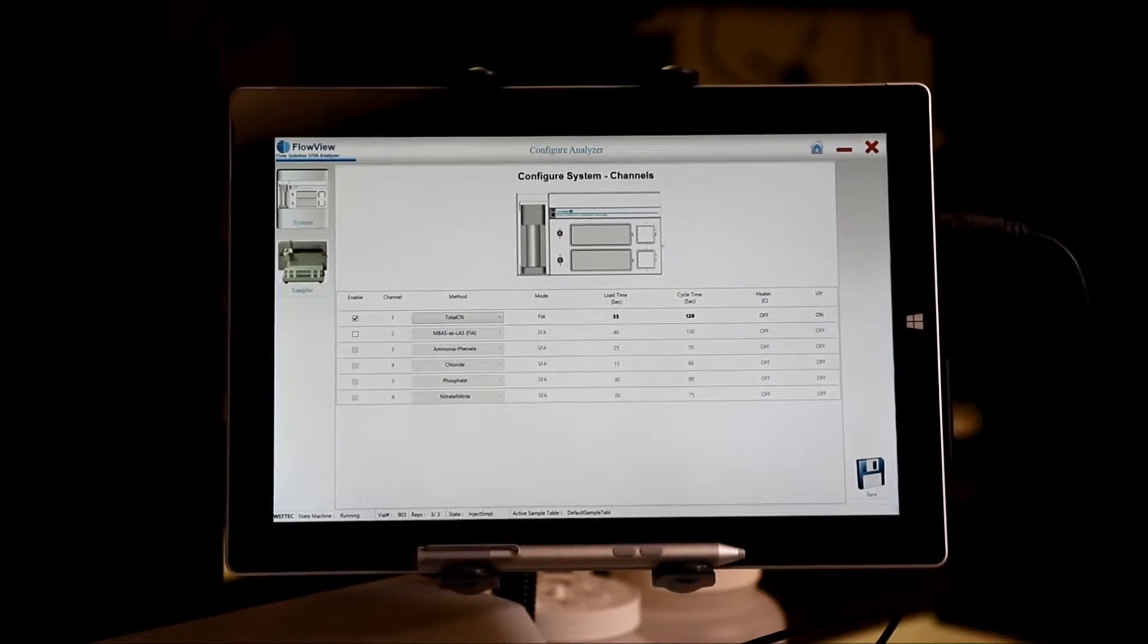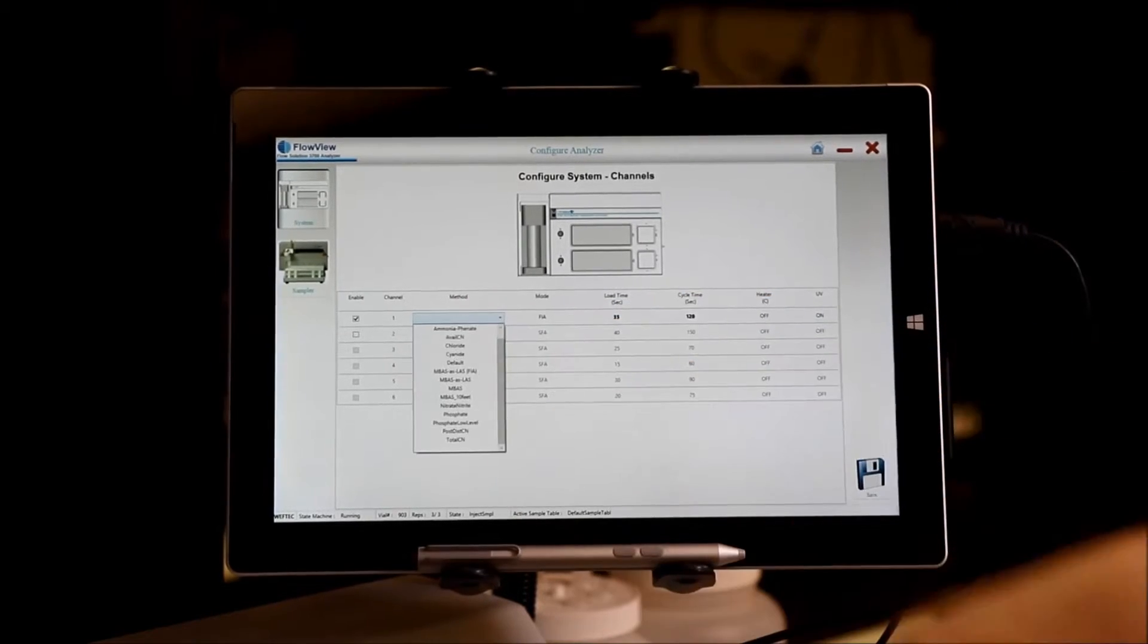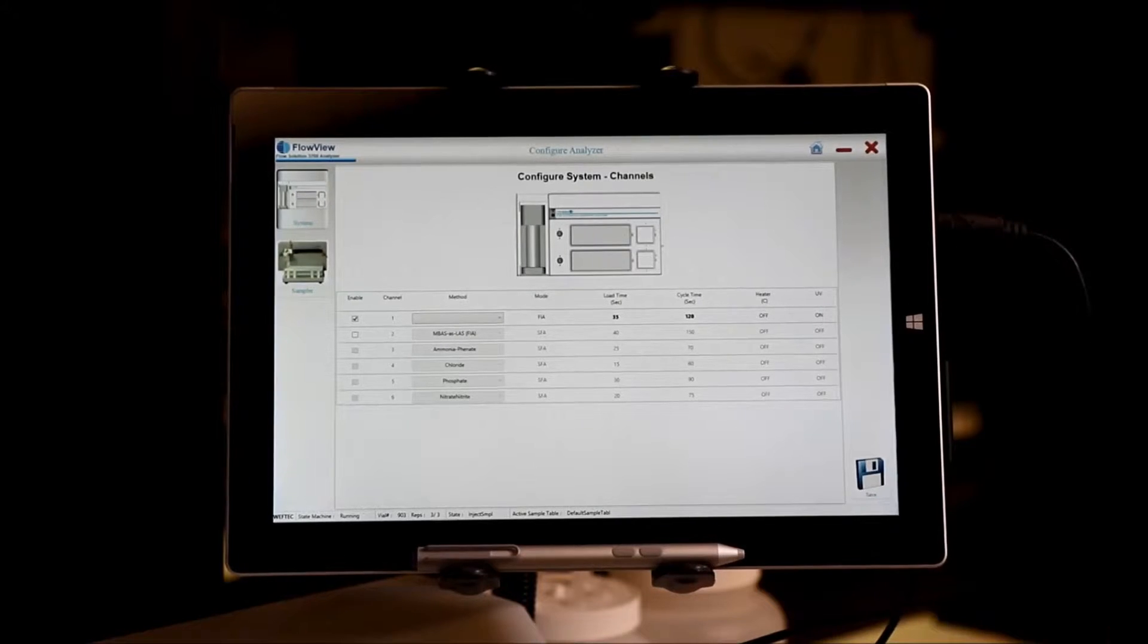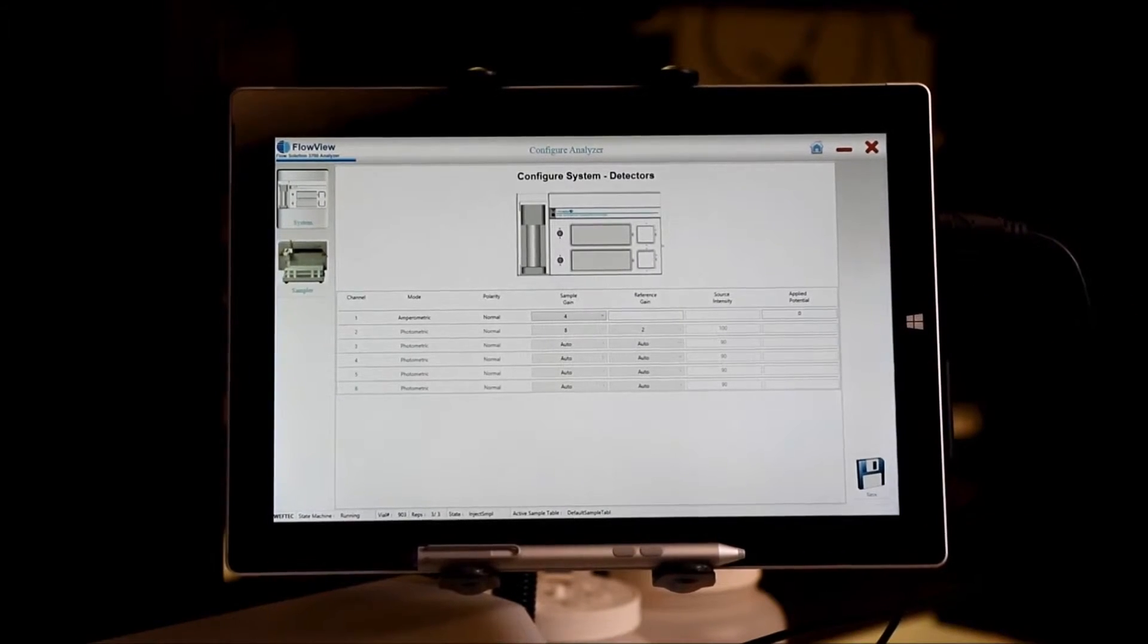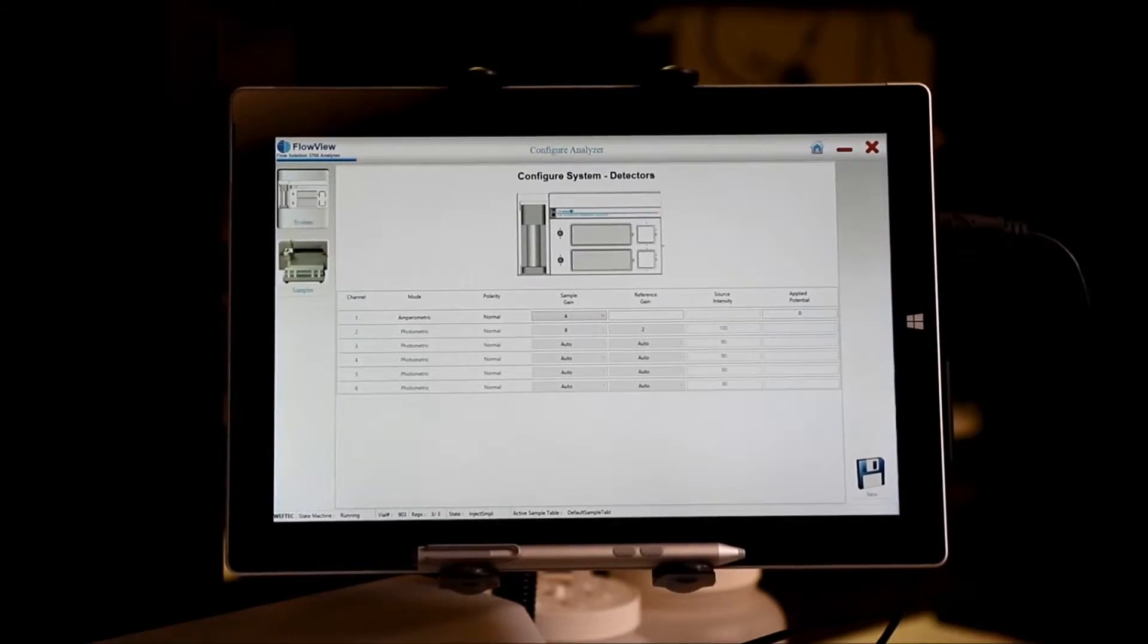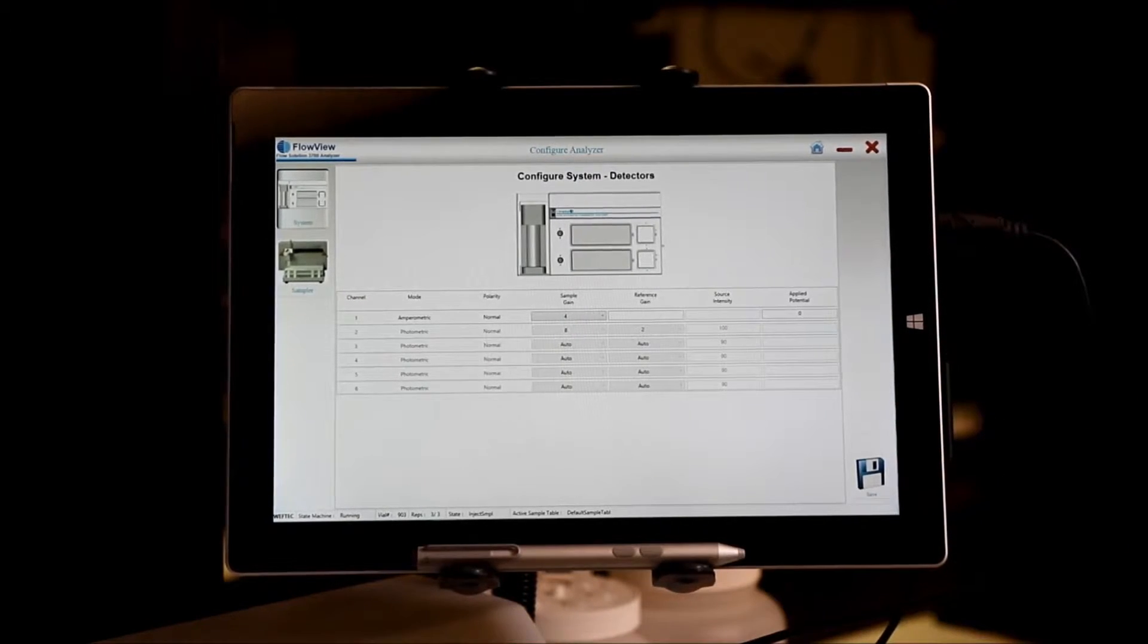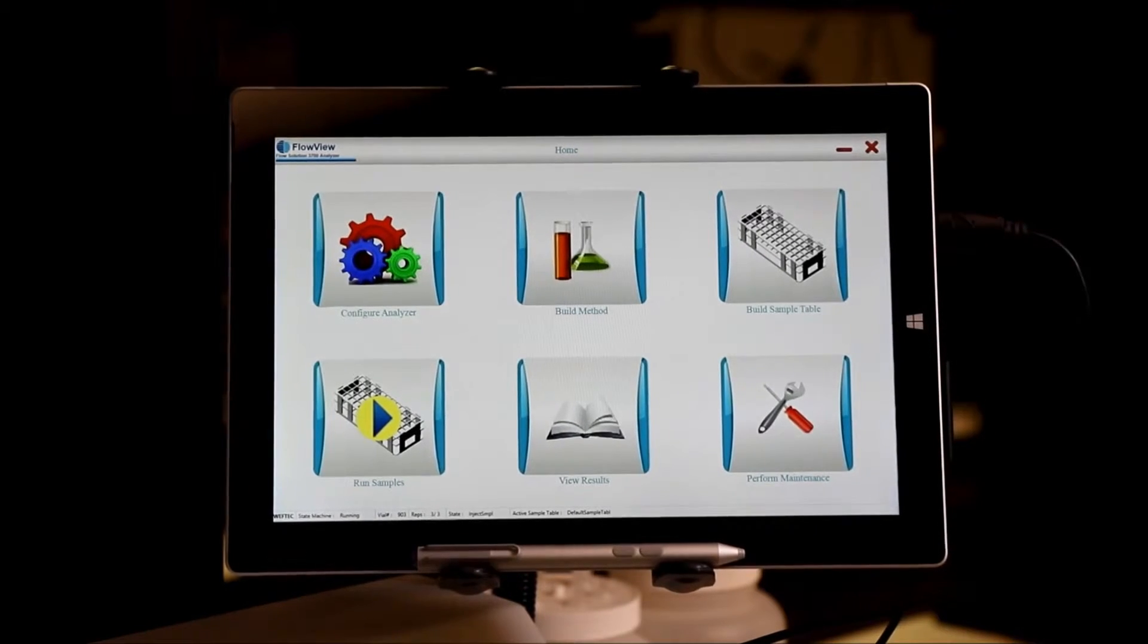Select what methods are needed and click save. Lastly, for detector settings, choose your sample gain or your source intensity for photometric applications, click save, and all of the information is transferred over to the 3700.